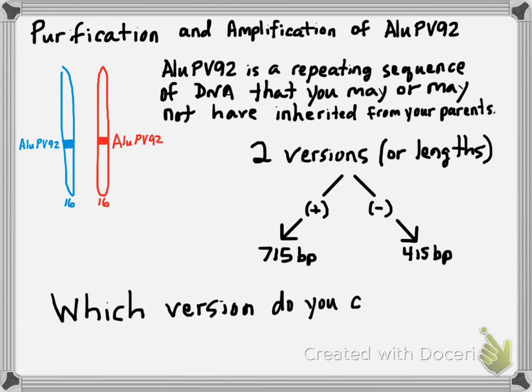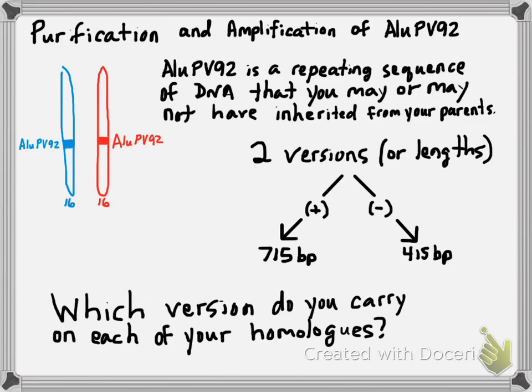So this lab is pretty cool in that you can find out your genotype, which is nice to do in class. We can use analysis of our class data to learn something about our ancestry, and in a general sense determine if evolution is occurring in a population. We'll do all this later on. Let's get started now.